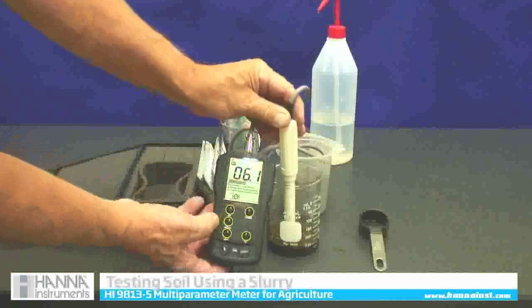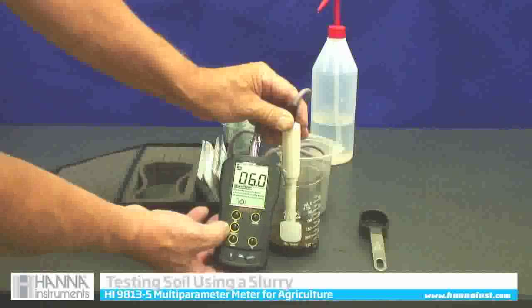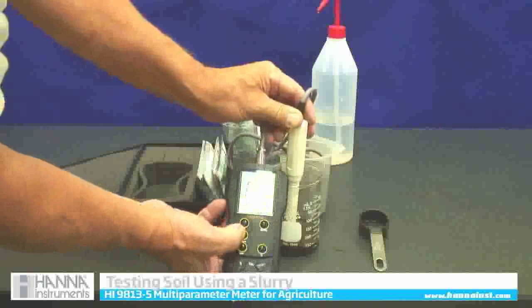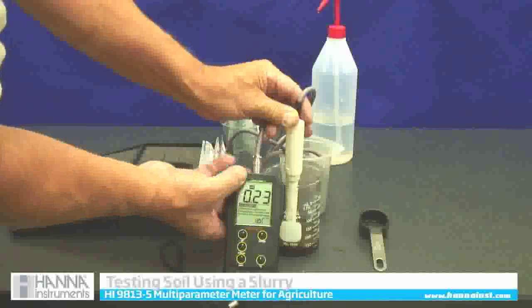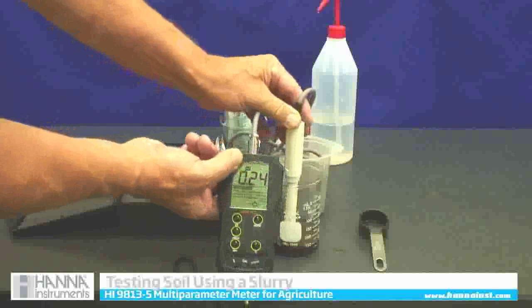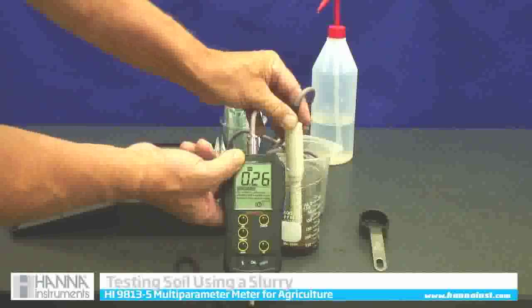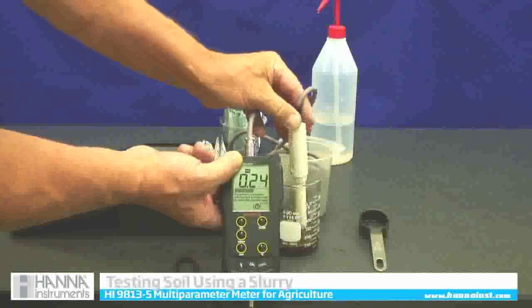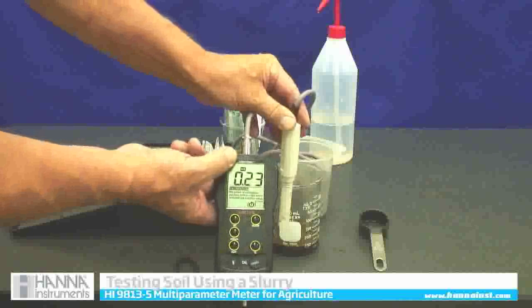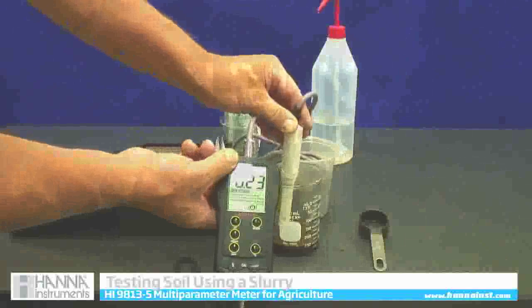To read the electrical conductivity, we're going to use the MS over centimeters setting. Up in the top corner you'll see the MS code, which means we're on millisiemens. After swirling, there is our millisiemens reading: 0.23. So this is not very fertile soil at this stage.